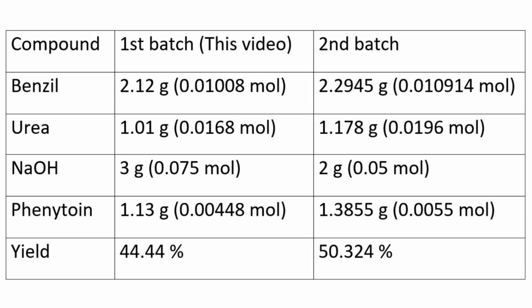As I said before, I ran a second batch using these quantities, and I got a 50% yield.